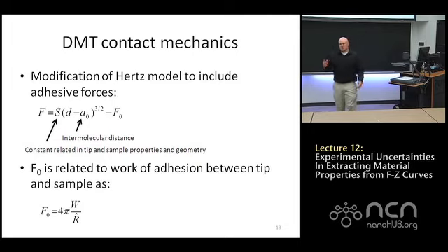If you have a surface, another surface, and a surrounding medium, the work of adhesion is equal to the surface energy of the surface plus the surface energy of the other surface minus... no, never mind. Don't worry about that. I wasn't planning on talking about that anyway. But if you want to read up on that, Israelachvili is a great reference. Yeah, the Dupre equation. I was saying surface energy when I meant interfacial energy.